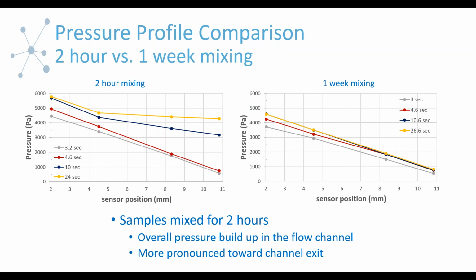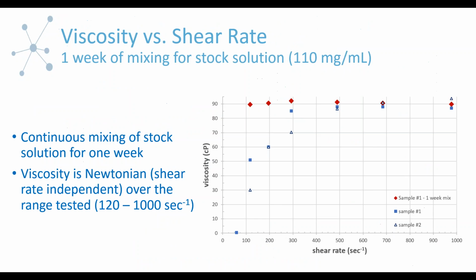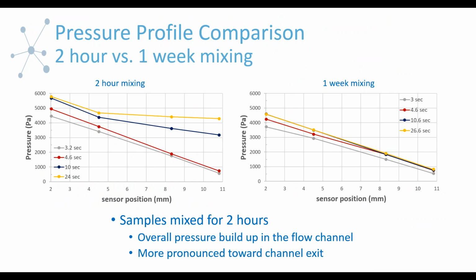But if we get to the higher flow rates, let's just jump back for a second. When we get to the higher flow rates, the behavior becomes more normal. So in theory, these higher flow rates force this buildup out that might artificially bump up the pressure. It's speculation, as I said, because we can't visualize the flow field in any way.